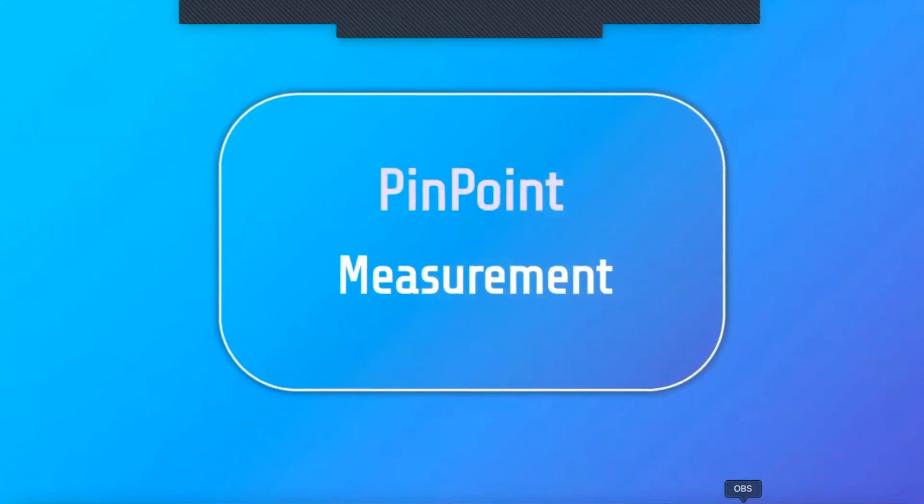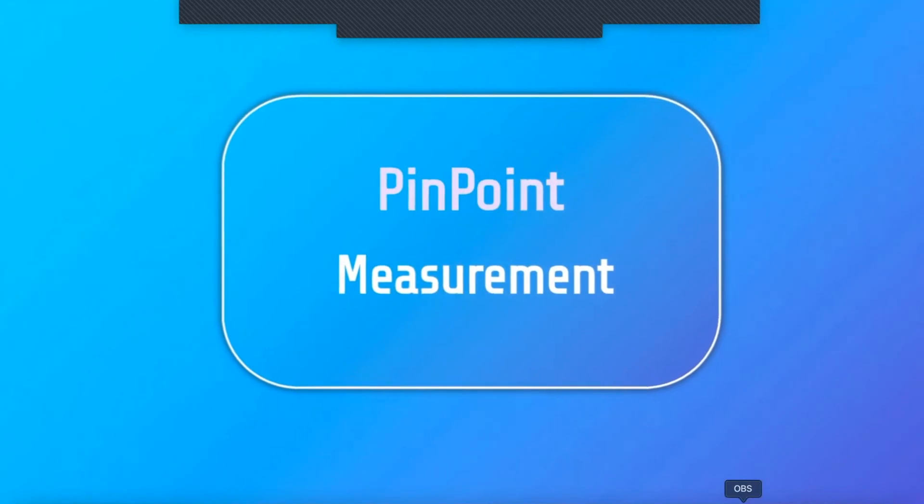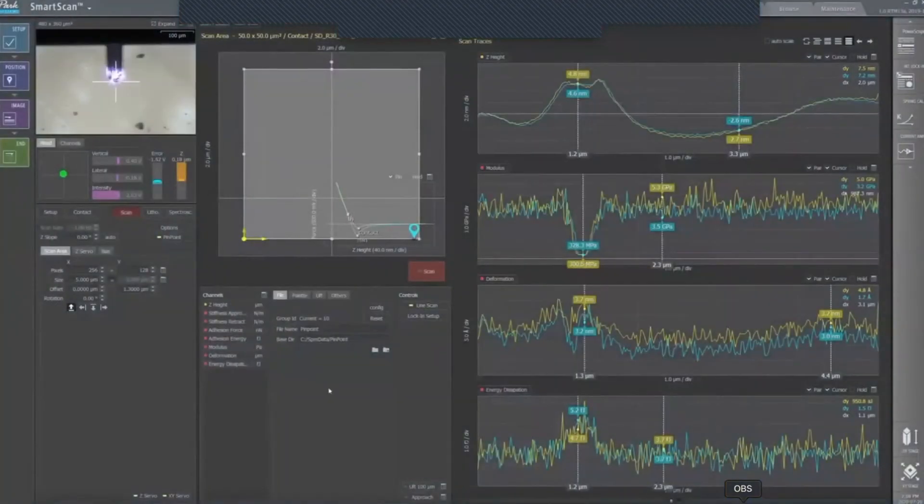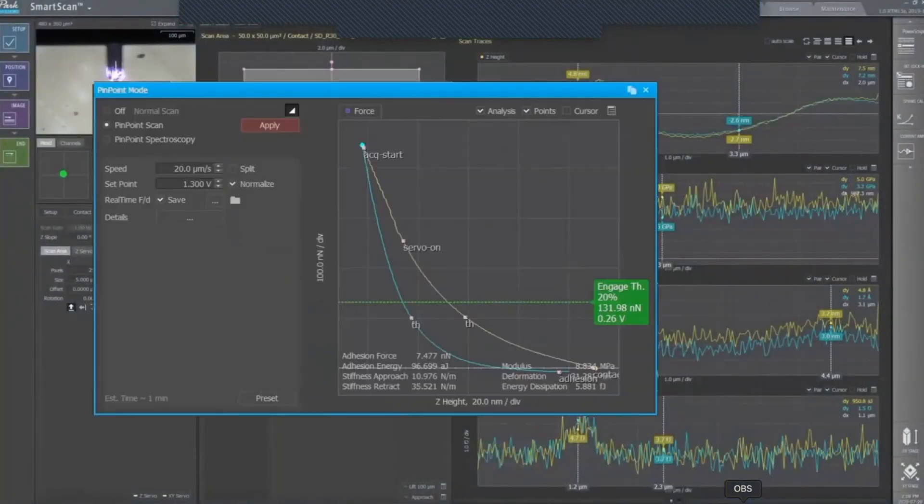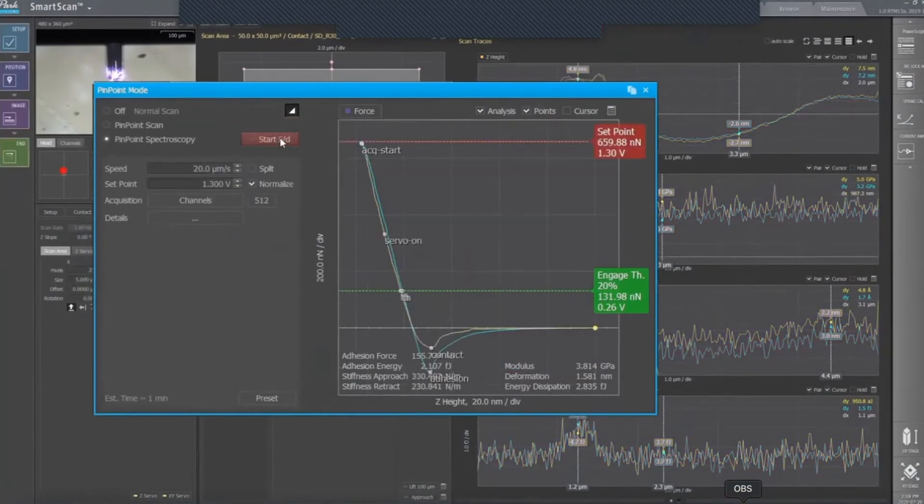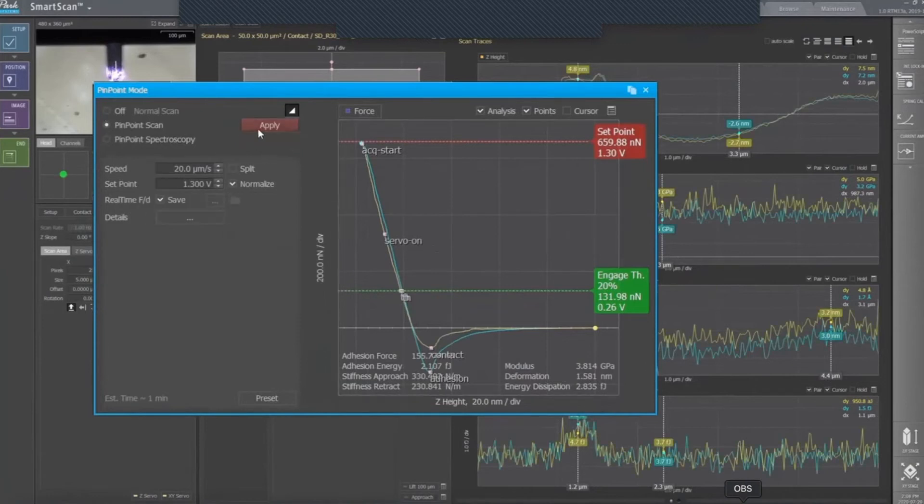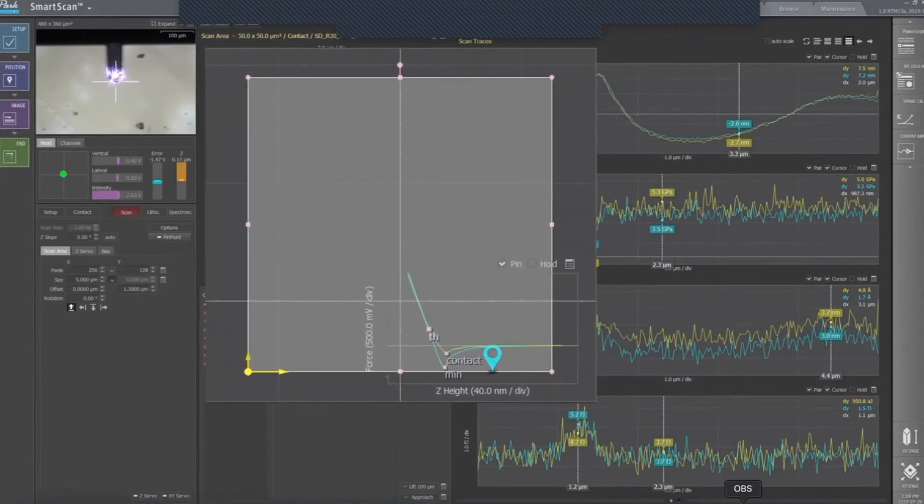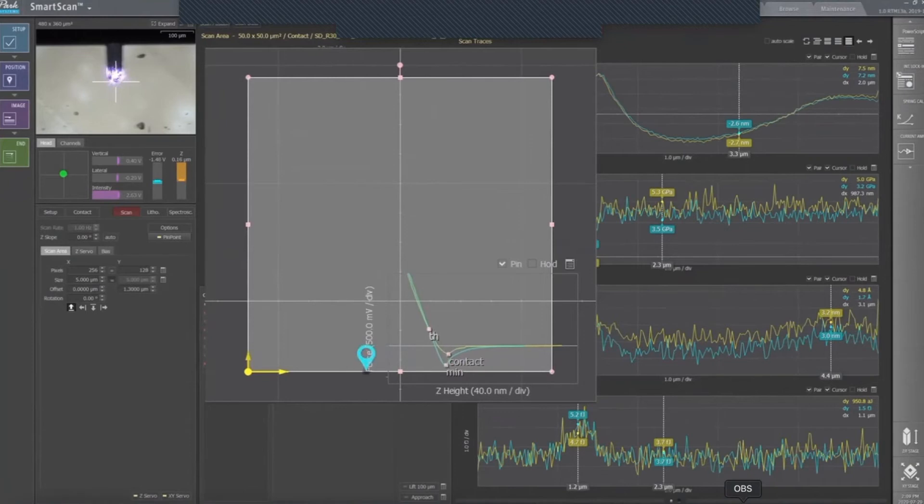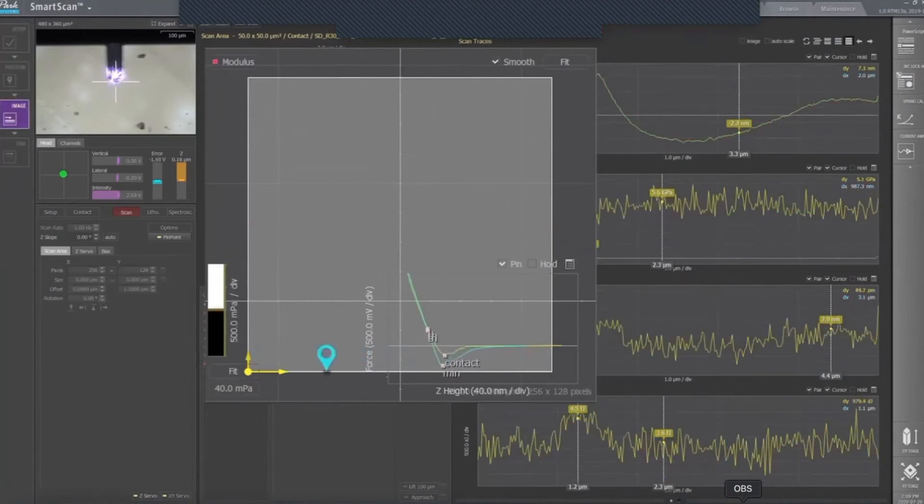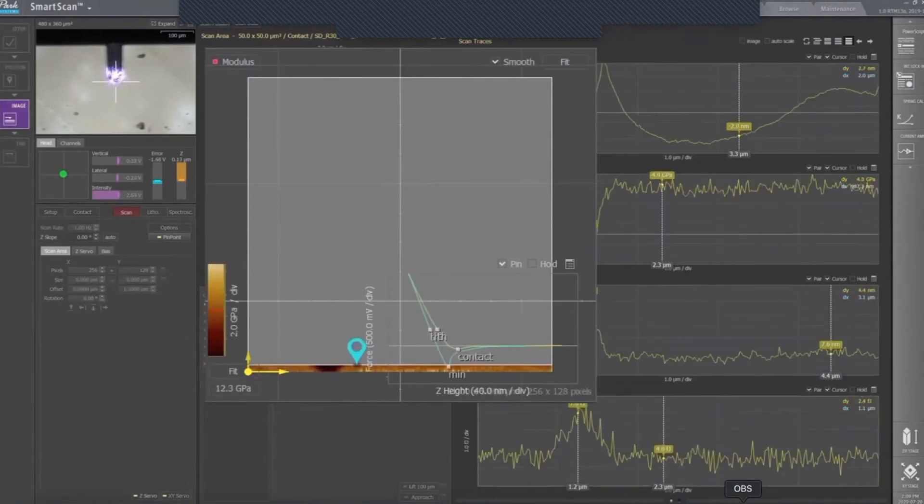Once calibration is done, you have to go back to scan mode and select the advanced option to activate the PinPoint mode. When the window opens, select spectroscopy. There, you can modify parameters such as speed, setpoint, acquisition channels, or more advanced settings in the details option. When everything is ready, click on start force distance curve, and PinPoint will start to acquire the data in real-time.